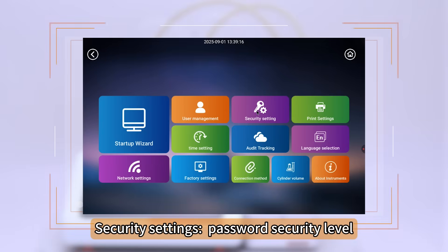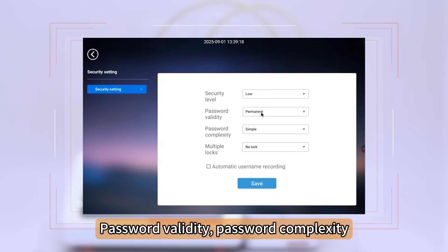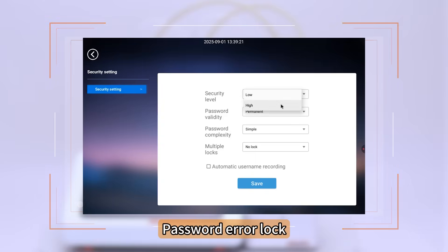Security Settings include Password Security Level, Password Validity, Password Complexity, and Password Error Log.